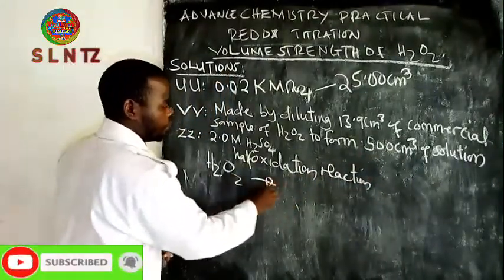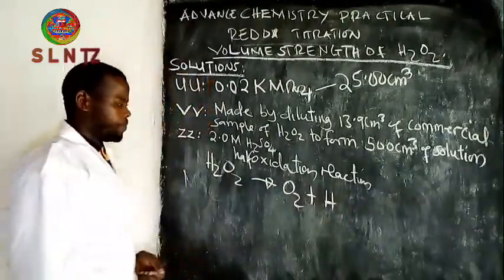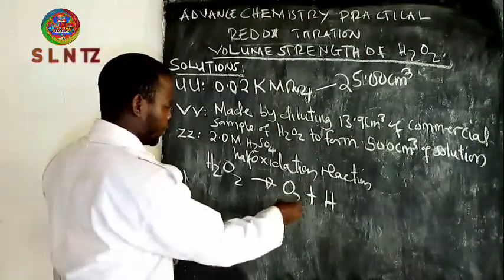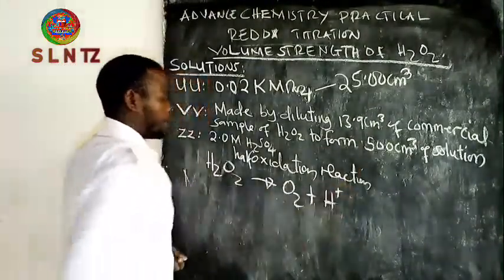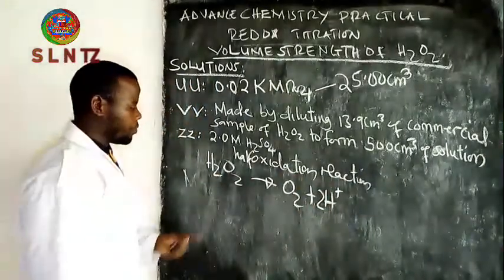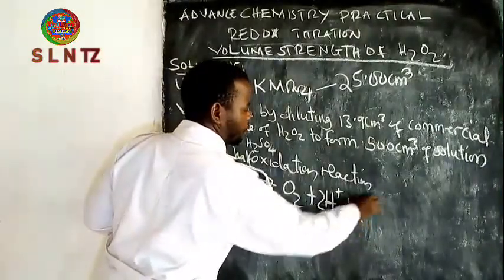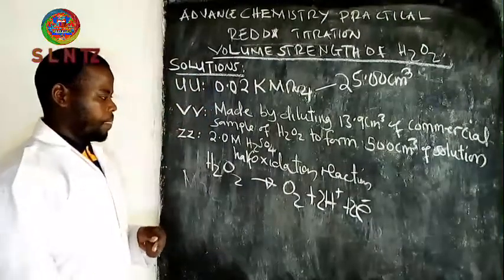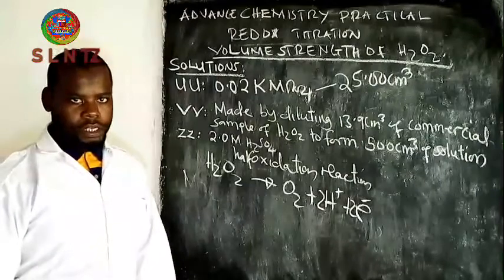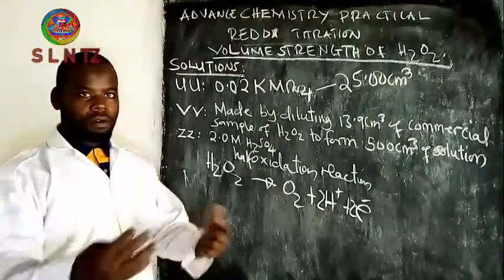Peroxide decomposes to oxygen and hydrogen ions within our reaction. So here there is 2, but here is 2. In order to balance the charges, you have to add 2 electrons. That is our half oxidation. You can note it, and then you proceed to the overall.